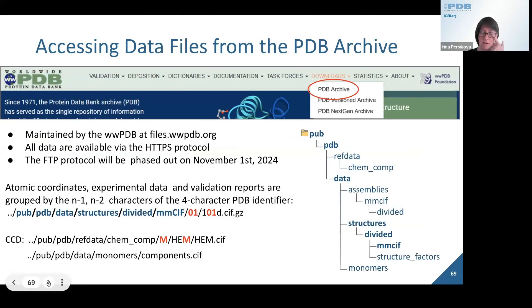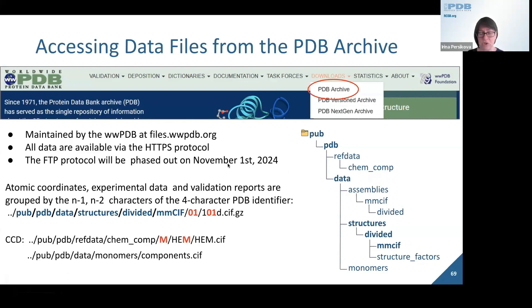Moving on to data access: the main PDB archive is maintained by the wwPDB at files.wwpdb.org. The data are available through the HTTPS protocol. Note that the FTP protocol will be phased out on November 1st, 2024. The atomic coordinate, experimental data, and validation report files are grouped by the two middle characters of the four-character PDB identifier, as shown in the example, and a similar logic applies to the chemical component dictionary files.